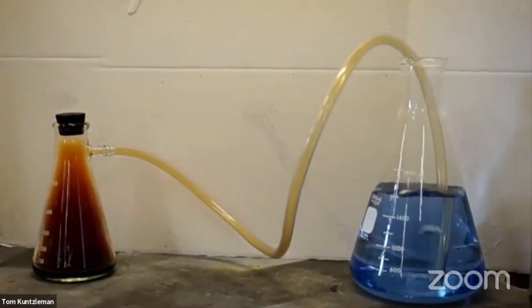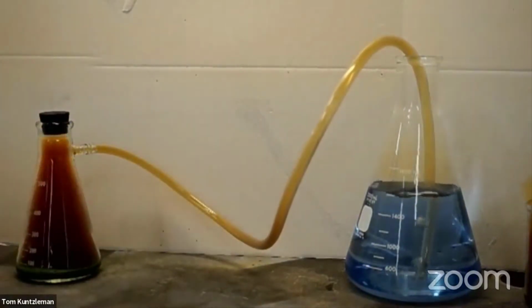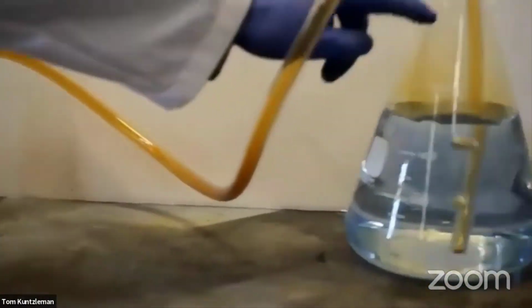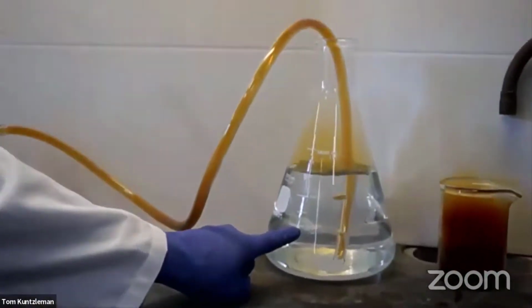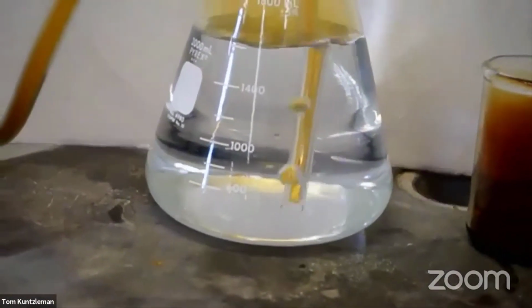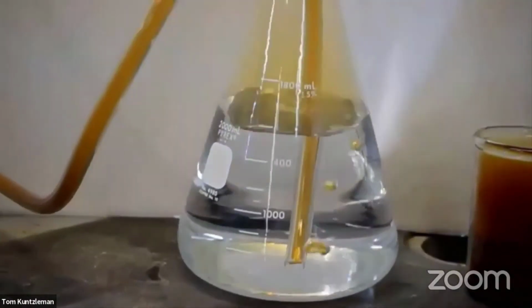That's kind of cool. I can hear it tickling around in here. You can even see the brown gas here in the tube. I see a little bit coming out here. What do you notice? Look at that color. What's going on there? What happened to the blue color? It's gone. The blue color disappeared. What do you think is going on there?